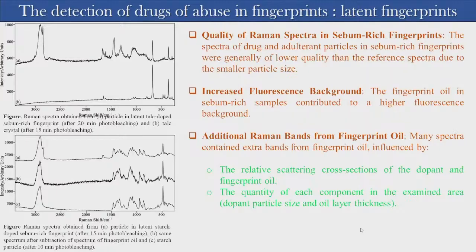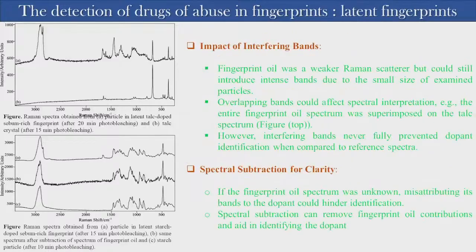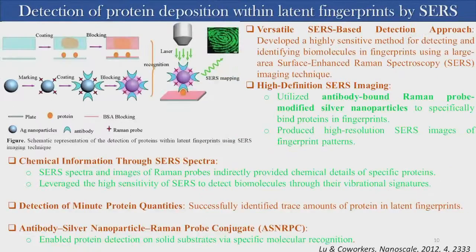For correction also, many people are doing just correction of the sample, correction of the background. About 2 years back I went to a Raman conference. There was a section in which three groups presented, and all three presented on how to analyze the Raman spectrum, how to get a corrected Raman spectrum from uncorrected raw data.